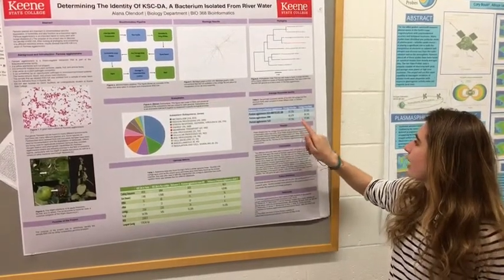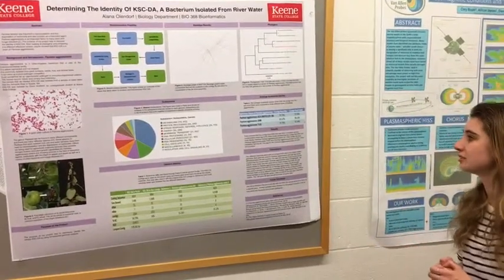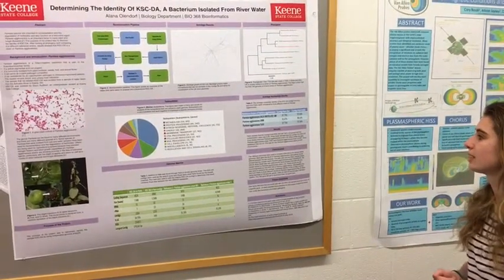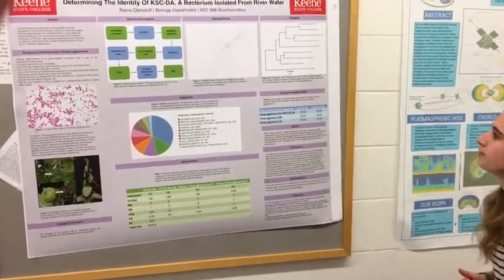And these are how similar the reference strains were. I put them through both the databases to show the difference that they would have. And they're all pretty similar except for this second reference strain.